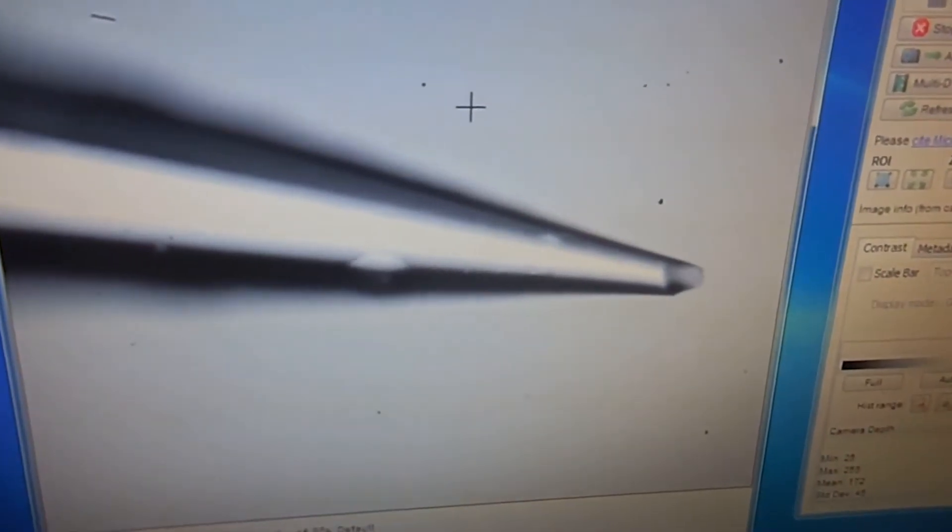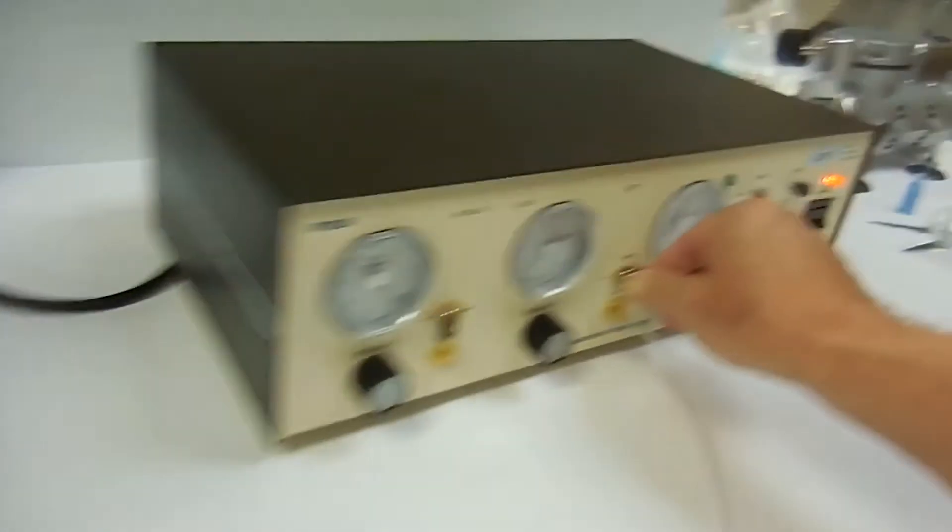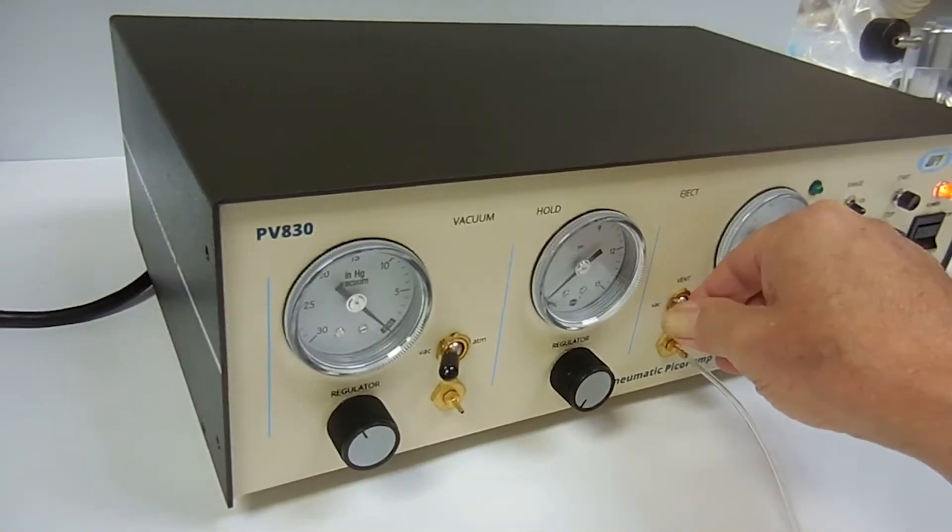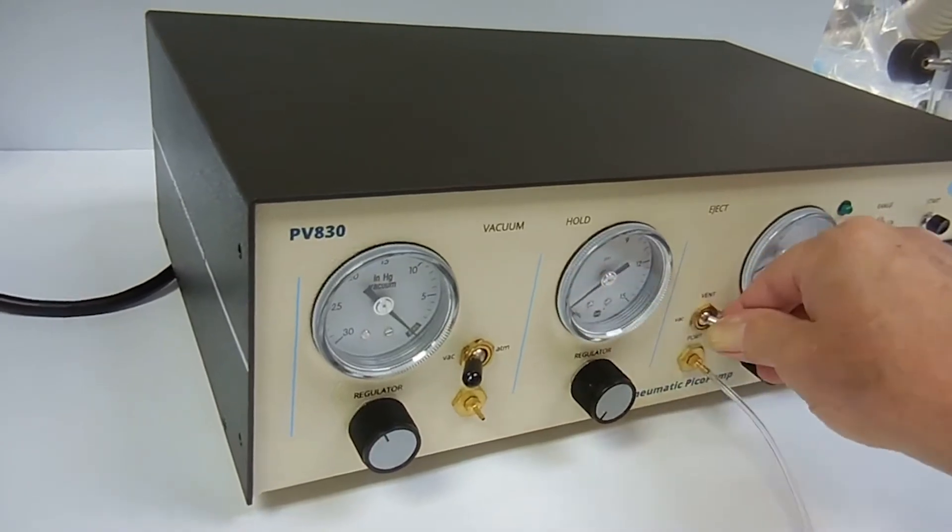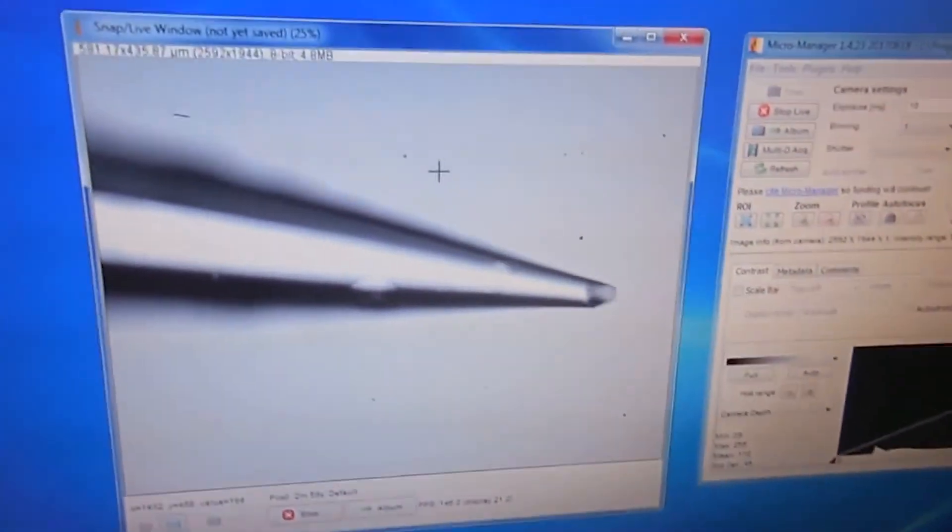If I flip the switch back and forth between vacuum and hold, I'm applying a slight hold pressure. You can see that needle change and over at the tip you can see the fluid changing.